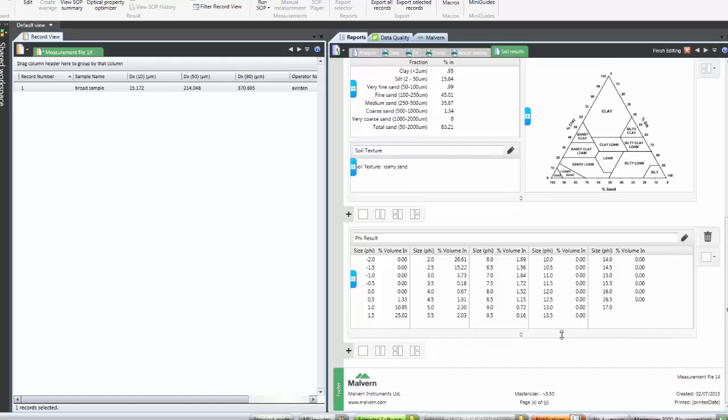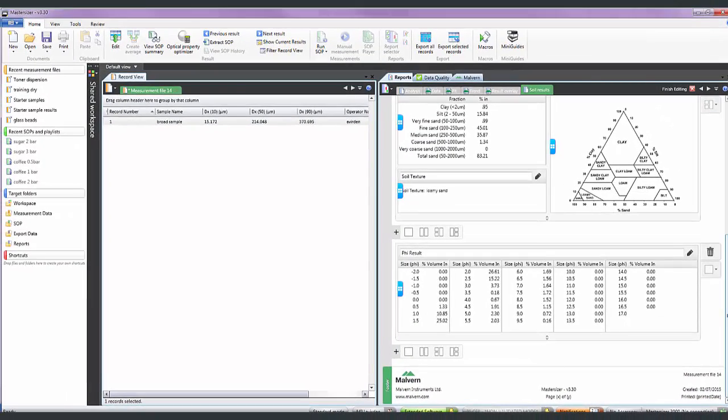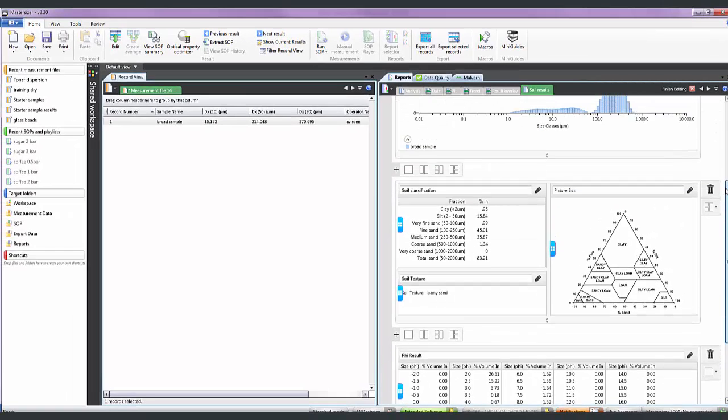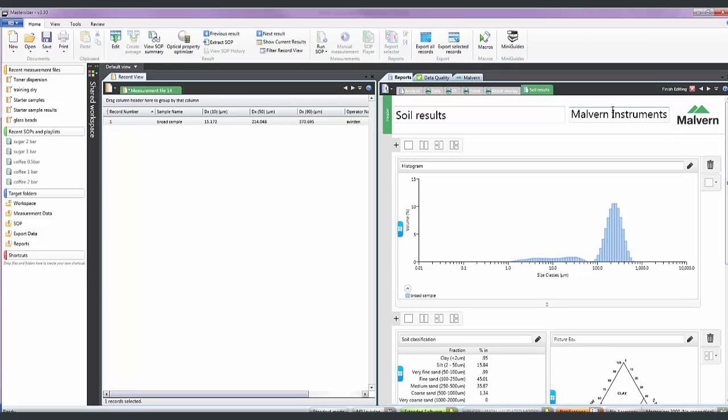So once I am happy with the layout of my report and the height of all the items, I can also change the default company name from Malvern Instruments to whatever I want.